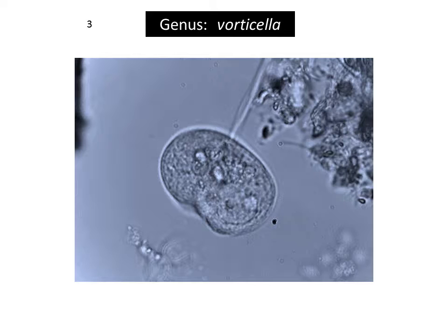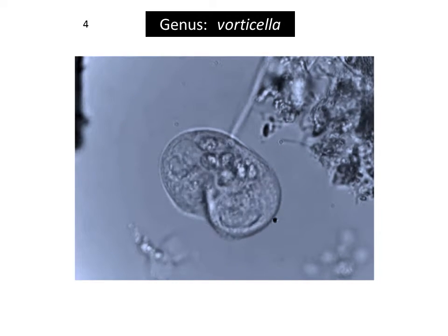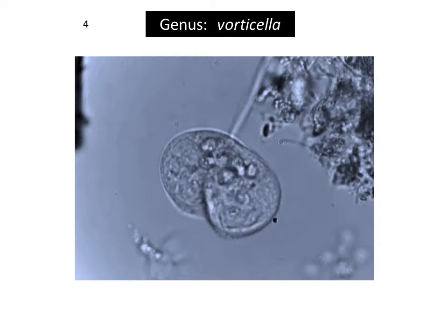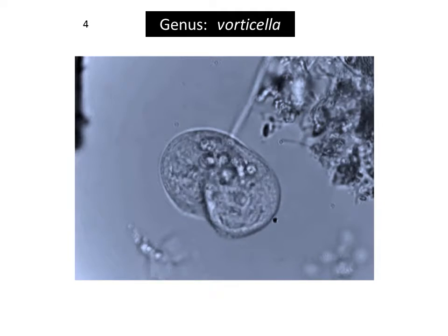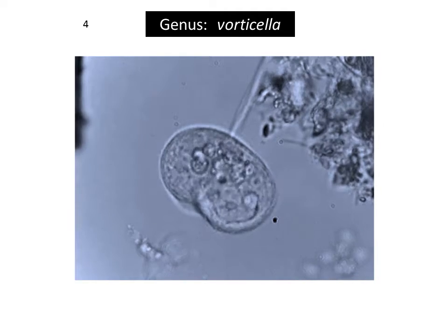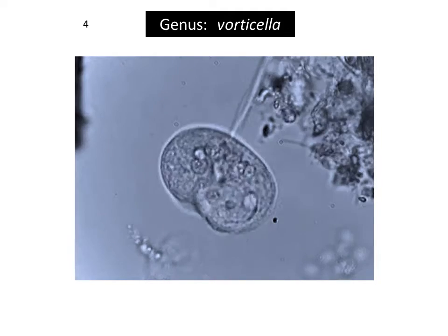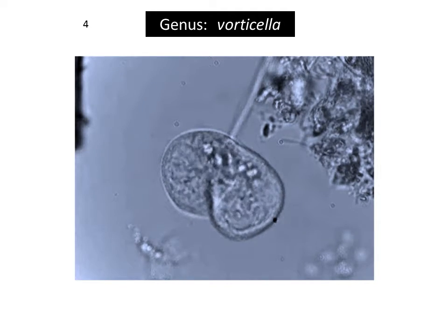In the movie, the visible process of division begins with the development of a crease in the anterior midline of the parent cell. This crease gradually extends posteriorly to form a cleavage membrane which progressively separates the two cell products, the parent cell on the left and the daughter cell on the observer's right. Note that during this period, the two cells appear to have open communication across the incomplete membrane.